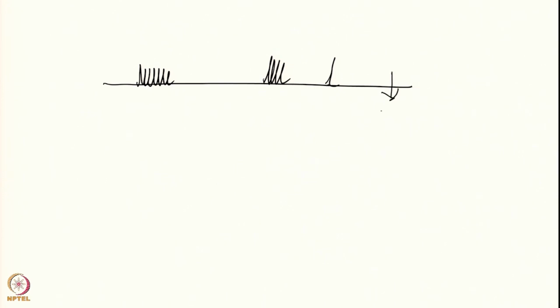So let us say as a result of this I get a new spectrum. What I do is I do 2 spectra. I have the same lines here, this is the unperturbed spectrum. For this I do a perturbation somewhere far away, this is called the off resonance perturbation.